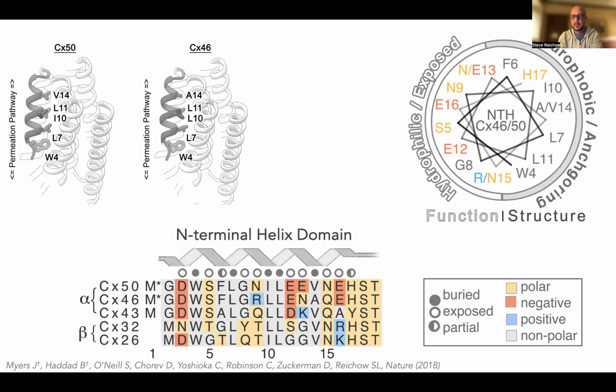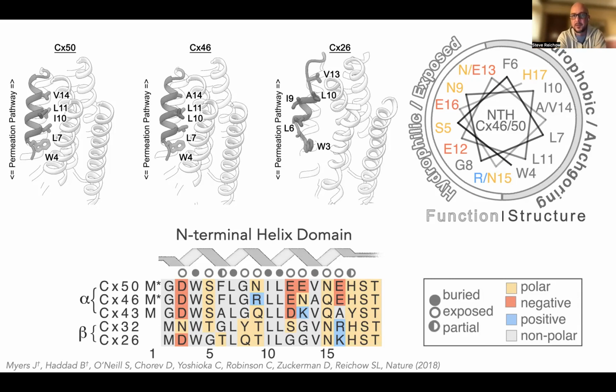This all seemed to make sense, but in comparison to the previously described X-ray crystallographic structure, this is the part of the channel that most deviated from the connexin 26 structure. In their model, you can see that they had many of these hydrophobic amino acids displayed in completely different orientations from what we resolved in our structures, and some of them were even pointing towards the permeation pathway of the channel. Ever since I started studying this structure, this part of the domain always caused a question in my mind, and it brought me back to the first structural biology course I ever took as a graduate student, taught by Wim Hol, who taught me that greasy groups like greasy grooves. Having these greasy groups nowhere near a greasy groove suggests that this wasn't a very energetically favorable conformational state.